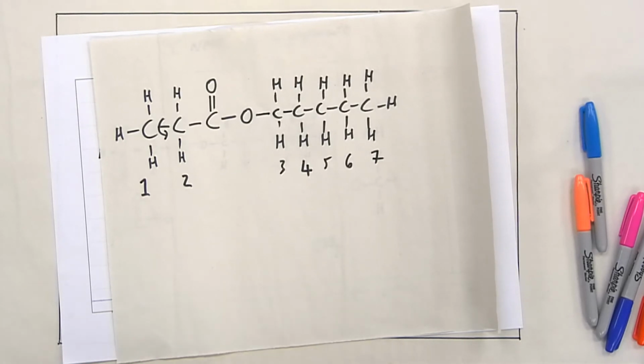Okay. And there is actually a question related to the aromatics. So we will come back to that one in a minute about the aromatic protons. We've got another example later on. Okay, right. So we're going to look at the proton NMR spectrum of this molecule. We've seen already that there were 7 chemical environments.